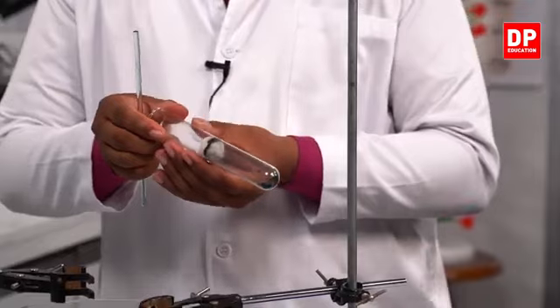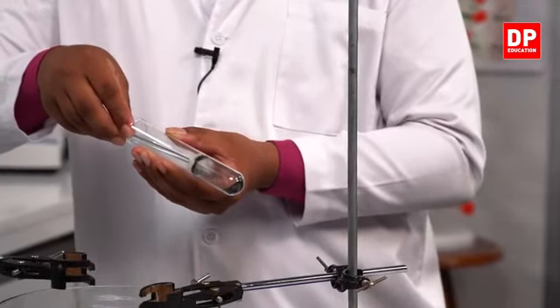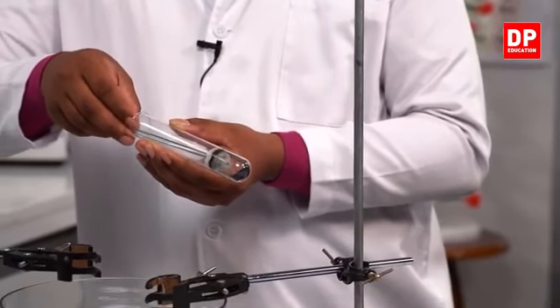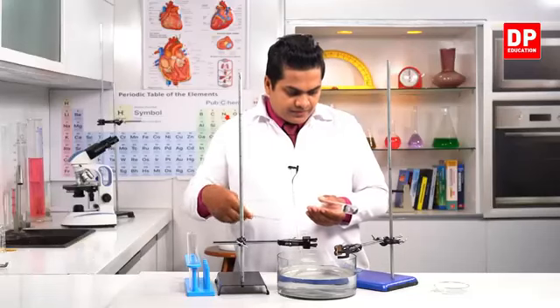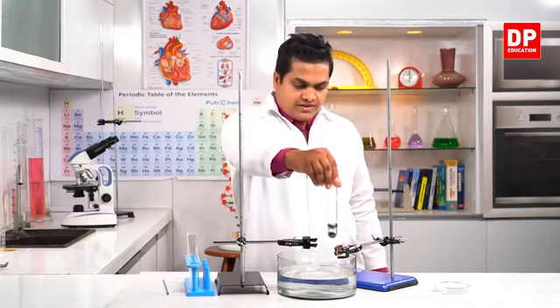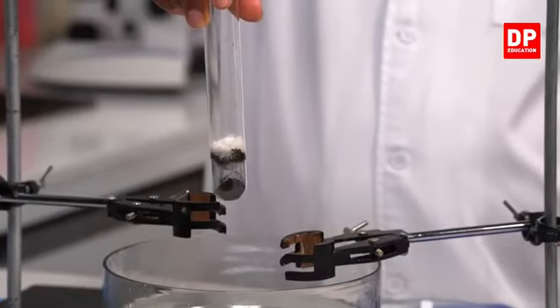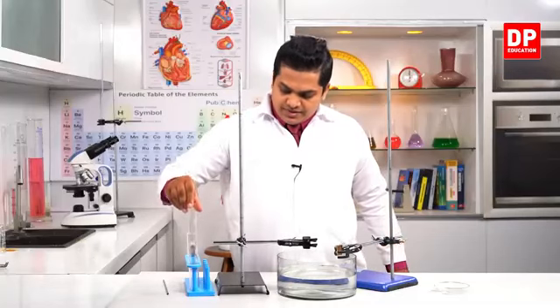So gradually I am inserting this into the boiling tube like this. So this is our first setup. Now I'm going to place it in here.